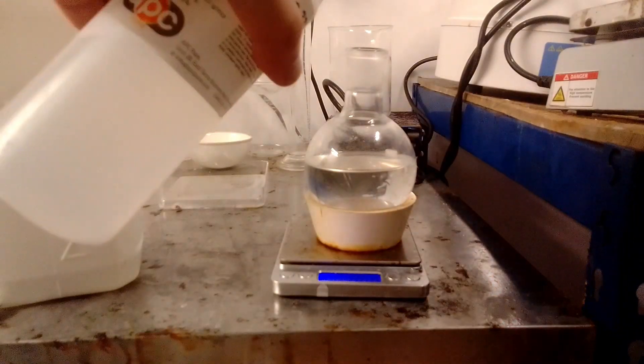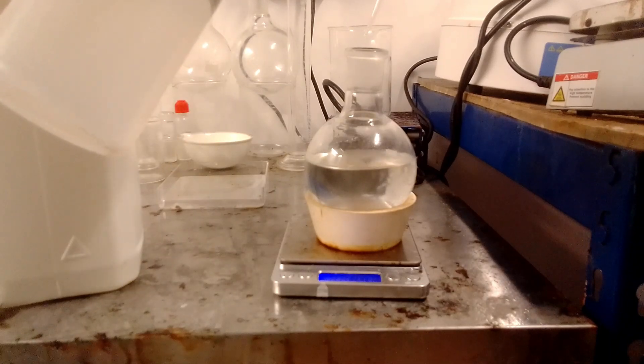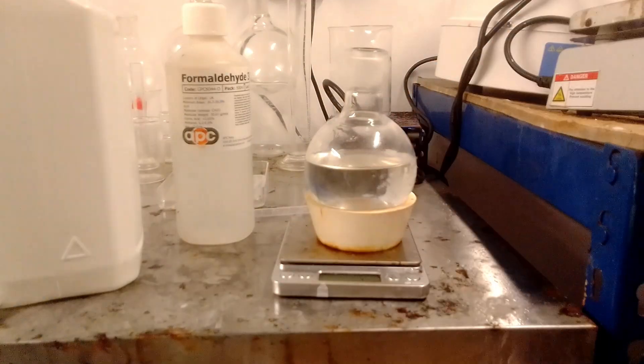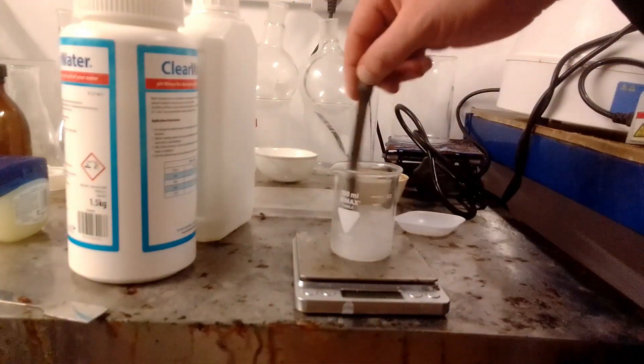Formalin was added to the filtrate. The mixture was heated to 80 to 85 degrees for about 15 minutes and then cooled to room temperature. While this was taking place, sodium bisulfate was dissolved in 36 grams of water for the next step.